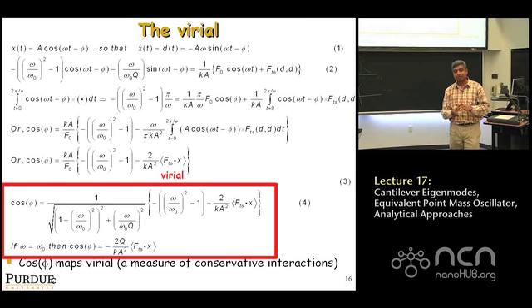What this means is, when you take a phase contrast image, you cannot just directly say, oh, this is dissipation. If you plot sine of phase, what you're doing is measuring energy dissipation. If you plot cosine of phase, you're actually plotting a measure of conservative interactions: van der Waals forces, elasticity, etc. Hardly anyone makes this distinction, but it's very important. Not surprisingly, if you get a contrast in phase, if the value of phi changes over the sample, obviously sine of phi and cosine of phi are also going to change over the sample. Okay?